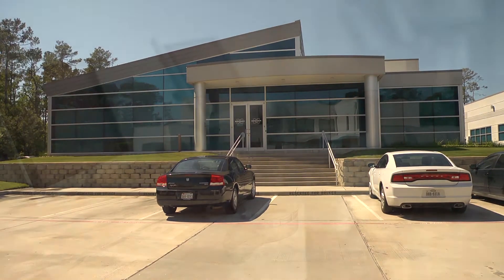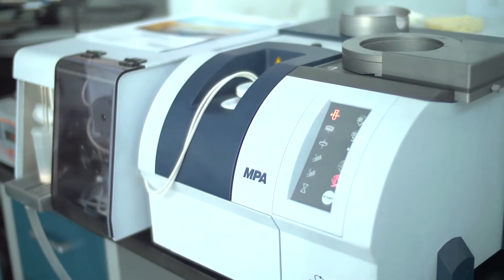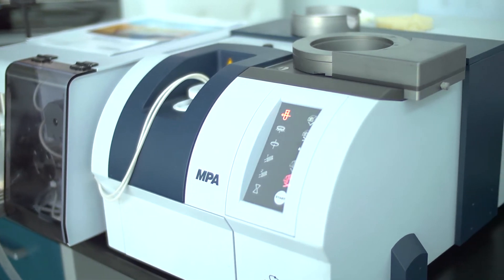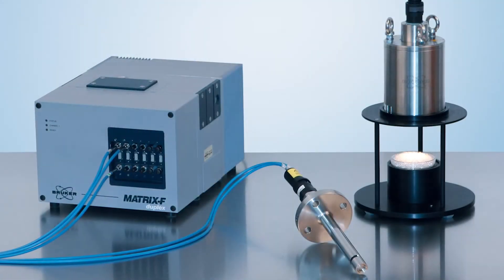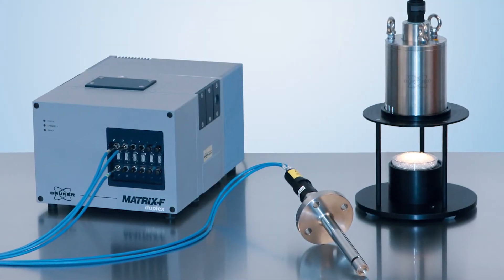Bruker's FT-NIR product line includes the Tango, the MPA and Matrix I spectrometers for lab and at-line applications, as well as the Matrix F-Series for process control.